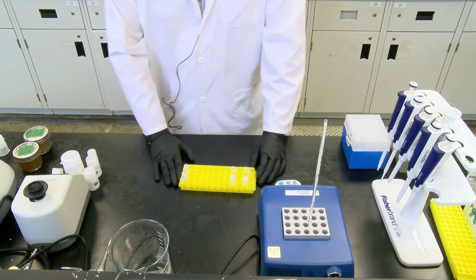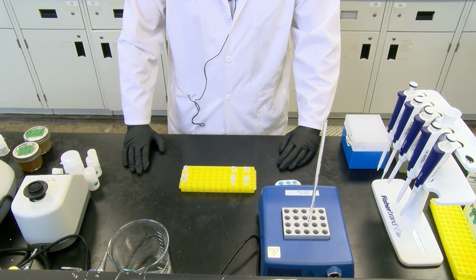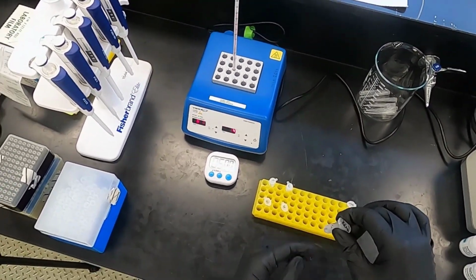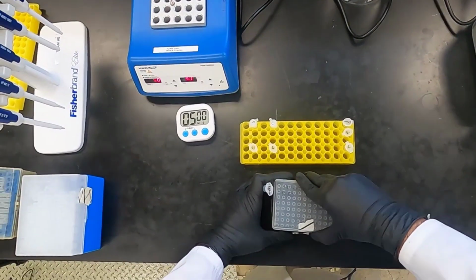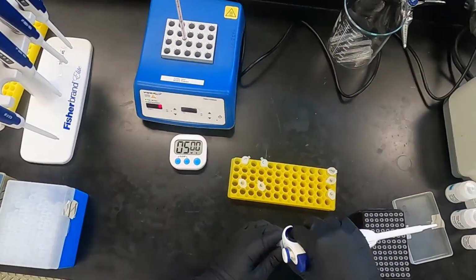Now, since we've covered that step, there's an optional step you can do. If you want your solution to be free of RNA, you can add RNase at this point. So I'm going to grab some RNase. And this, as you can see, has been on ice, so it's cold. Then we're going to add 4 microliters to each sample. So we're going to grab our pipette tips.